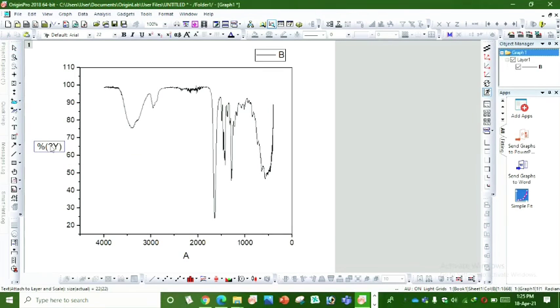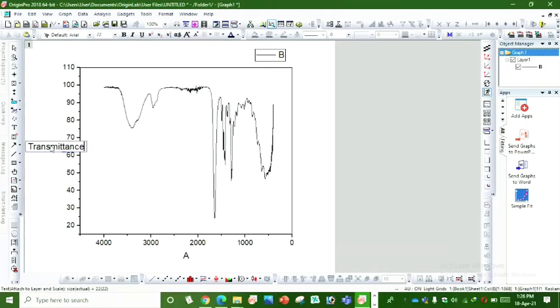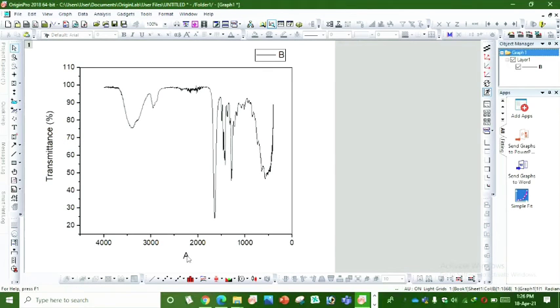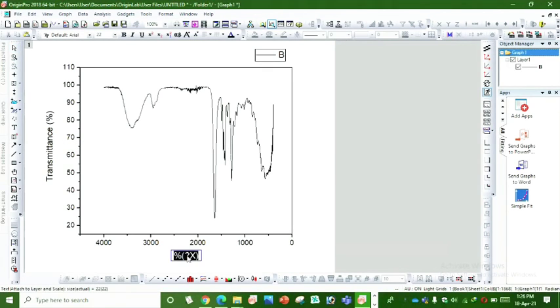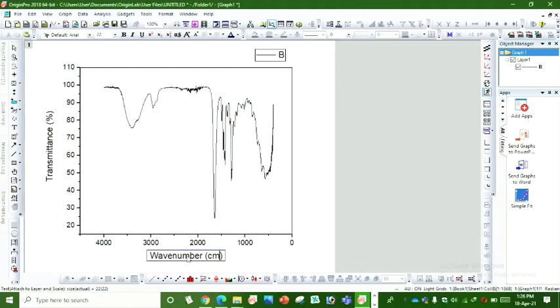By clicking on this, select all, you can write transmittance. As it is in percentage, we write percentage. On x-axis we write wavenumber, which is in per centimeter.